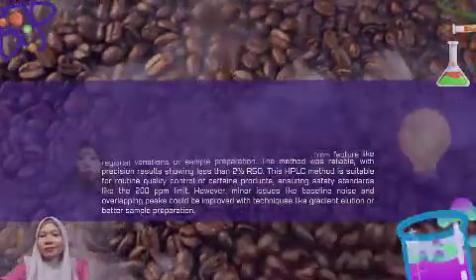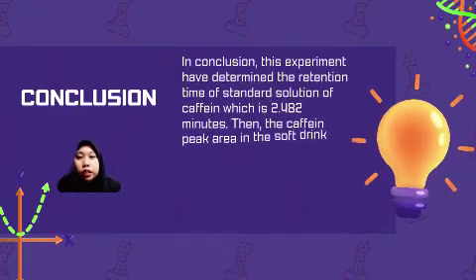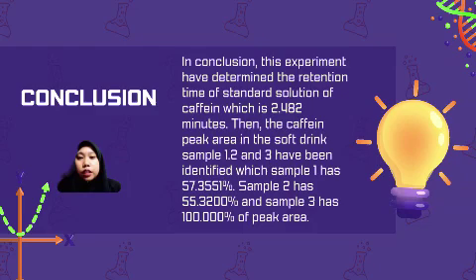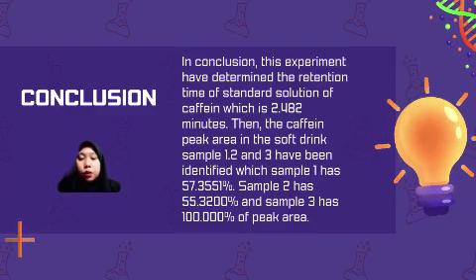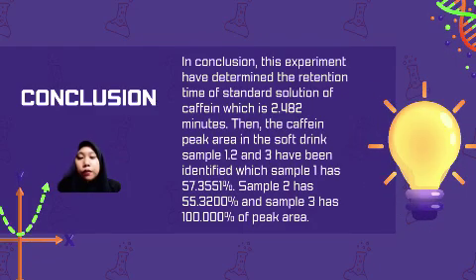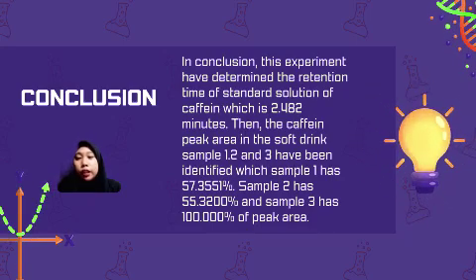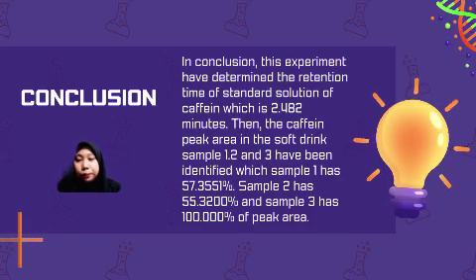That's all. We move to the conclusion. In this experiment, we successfully determined the retention time for a standard solution of caffeine, which was found to be 2.482 minutes. This value serves as a benchmark for identifying caffeine in other samples.